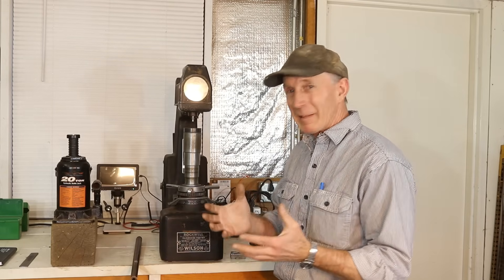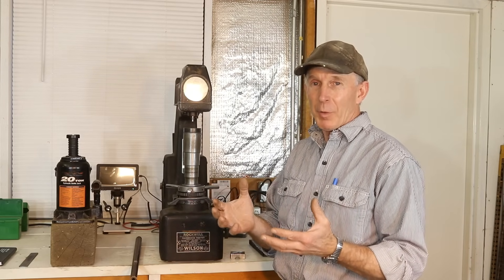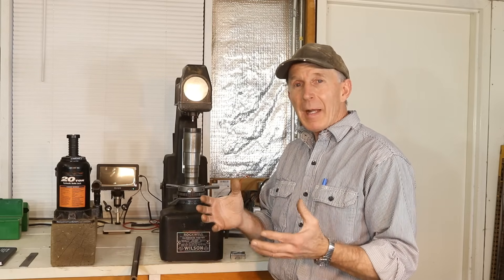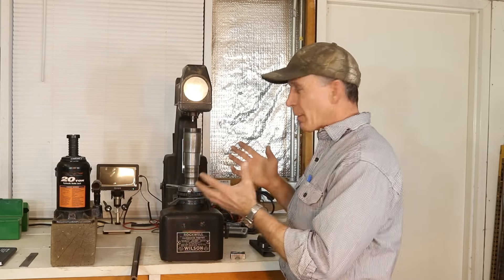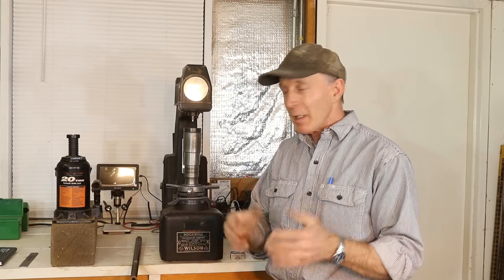Welcome to the Cinnabar. We just got in a piece of test equipment I've wanted for a long time: a Rockwell hardness tester. We were recently up in Montana picking up some barrel-making equipment from the estate of a legendary barrel maker and gunsmith up in the Bozeman area, and in his shop he had not only one but two Rockwell hardness testers. This Wilson we're keeping here at the Cinnabar, and then there was a beautiful ornate older model that will go over to Wyoming Armory in Cody. These things give us a world of opportunities for testing the hardness of different metals in guns.